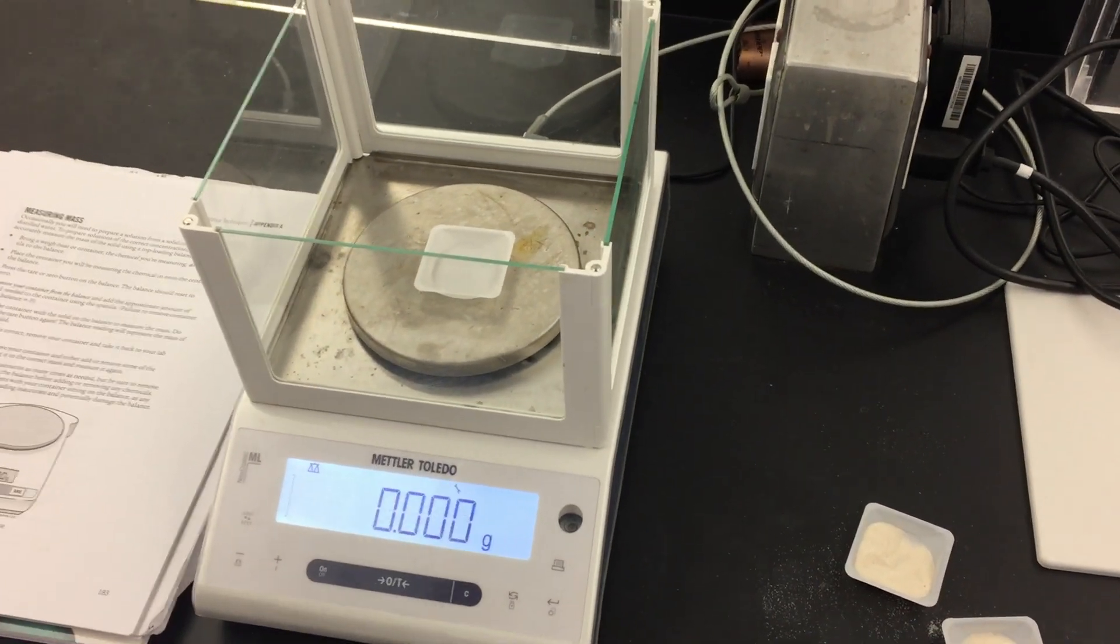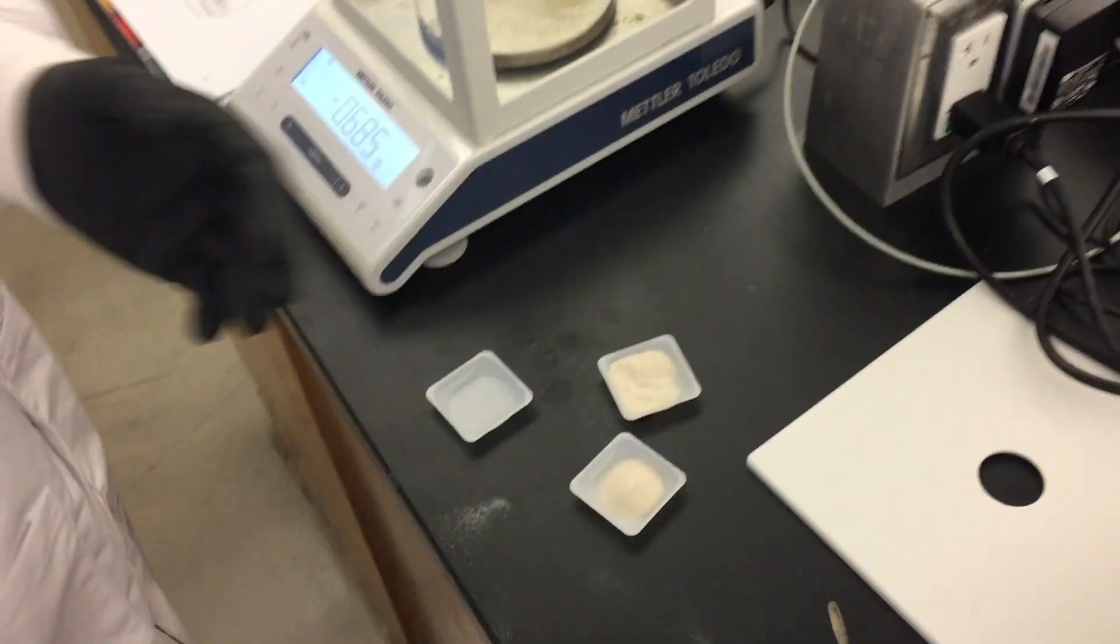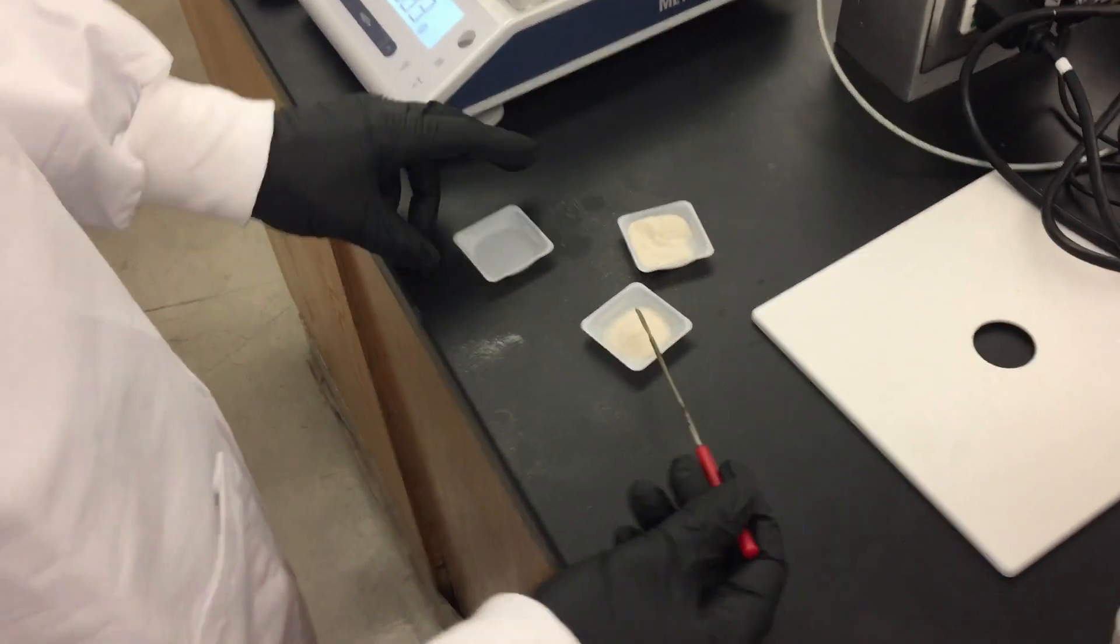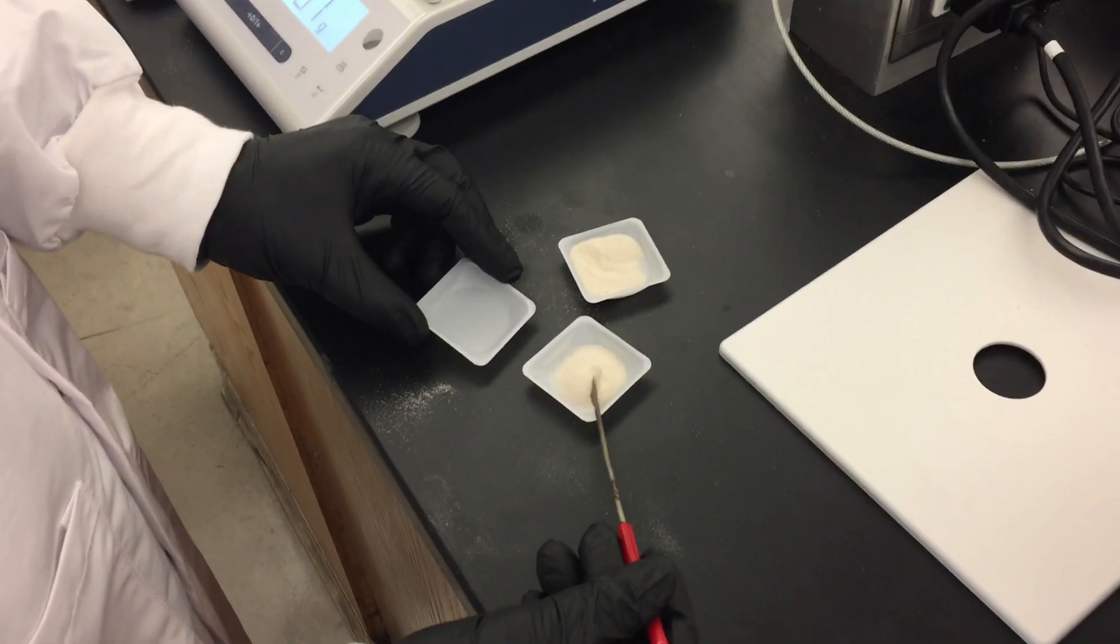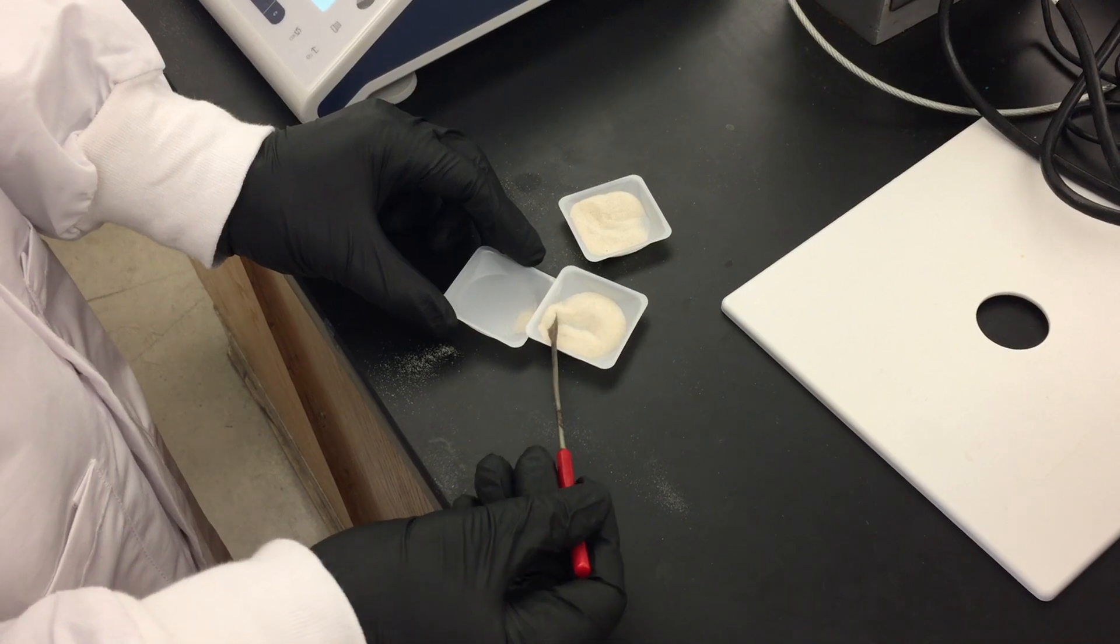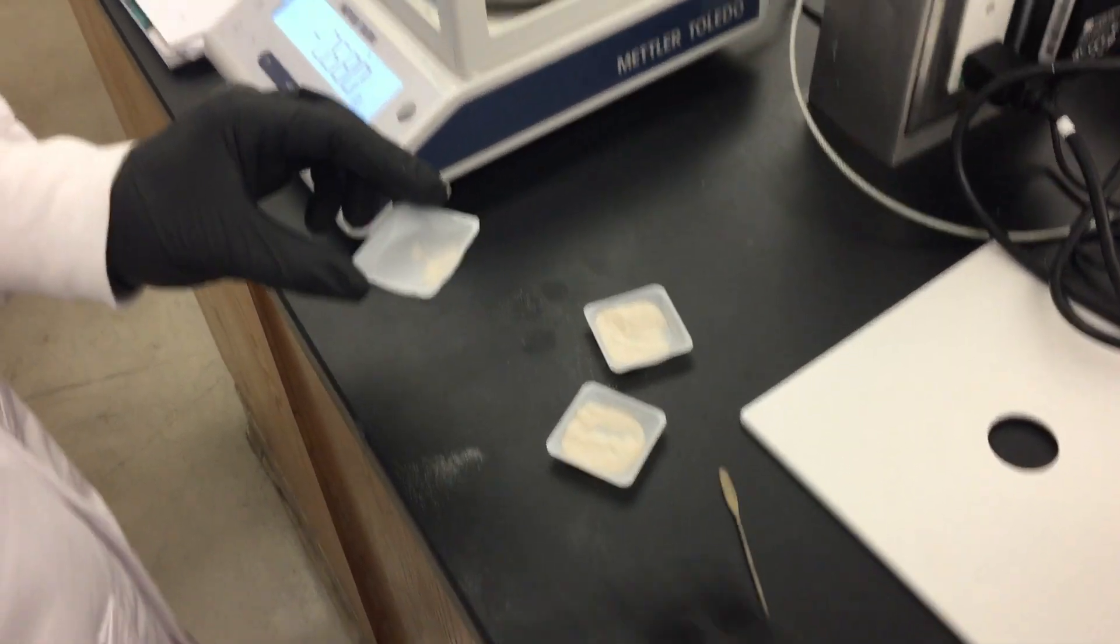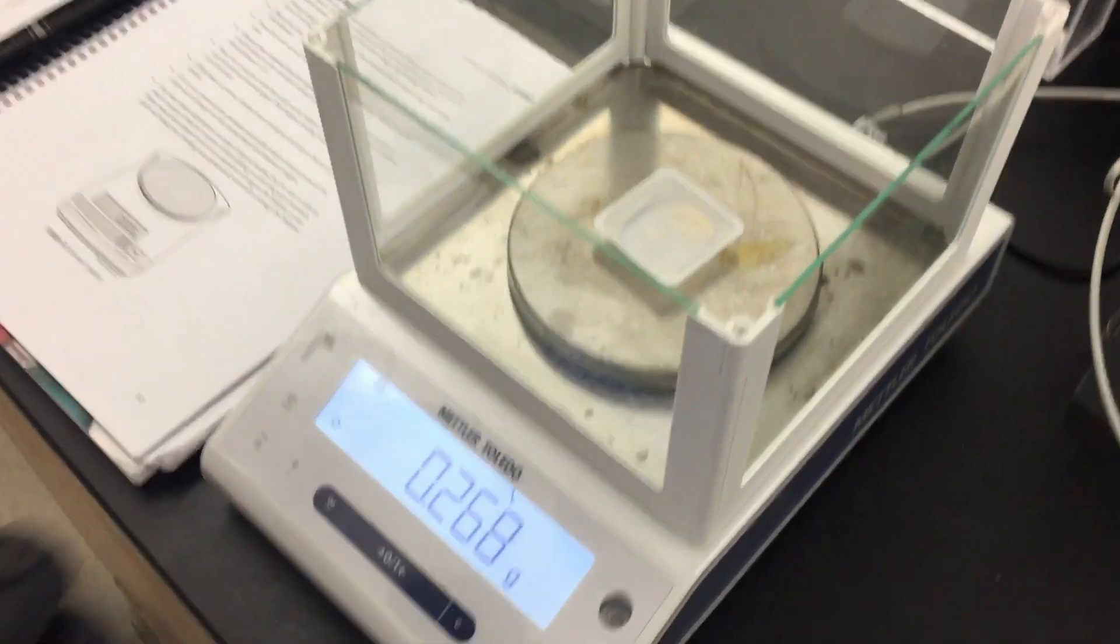Then we will remove the weigh boat and take the solid that we will be measuring. Using a spatula, we will put an estimate and then place it again on the center, not zeroing it out in between.